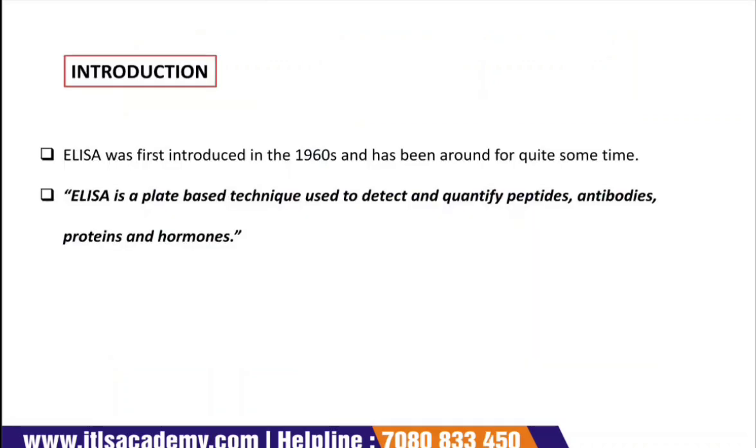So let's see the introduction part. ELISA was first introduced in the 1960s and it has been around for quite some time. What is ELISA basically? ELISA is a plate based technique that is used to detect and quantify peptides, antibodies, proteins, and hormones.